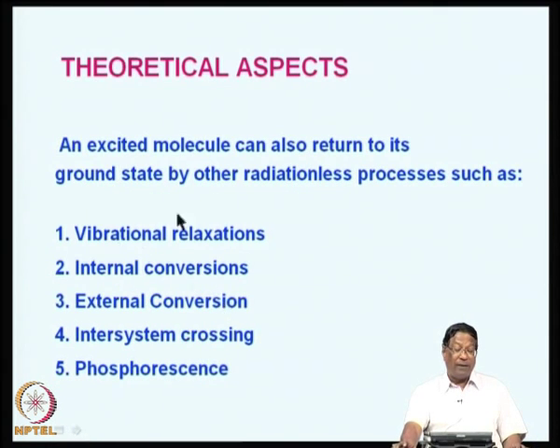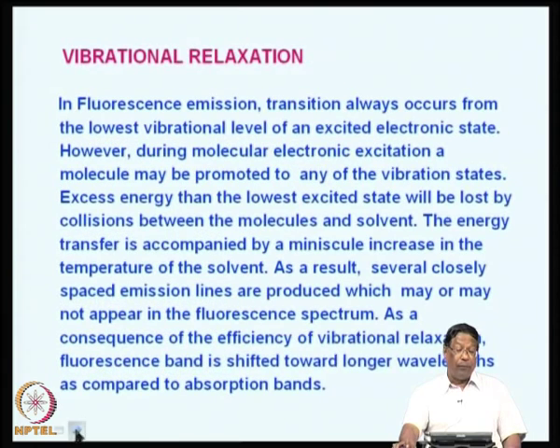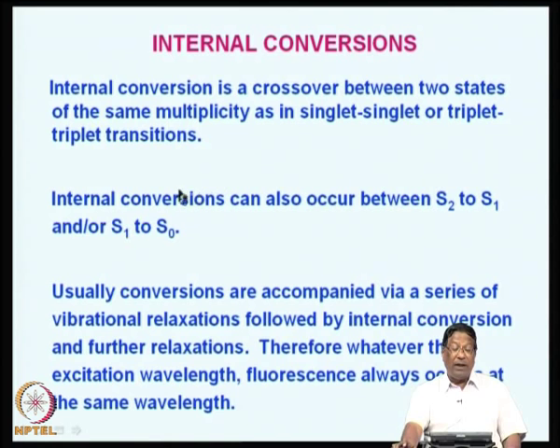So, the theoretical aspects we have discussed: an excited molecule can also return to the ground state by other radiationless processes such as vibrational relaxation, internal conversion, external conversion, inter-system crossing and phosphorescence. Then we discussed vibrational relaxation and internal conversions, that is between S2 to S1 and S1 to S0. Usually conversions are accompanied by a series of vibrational relaxations, as we have seen in the figure earlier. So, whatever the excitation wavelength, fluorescence always occurs at the same wavelength.